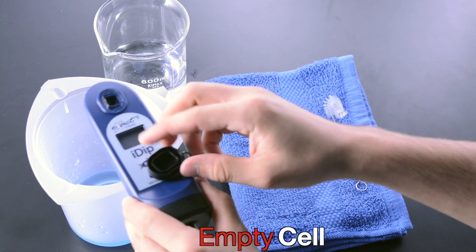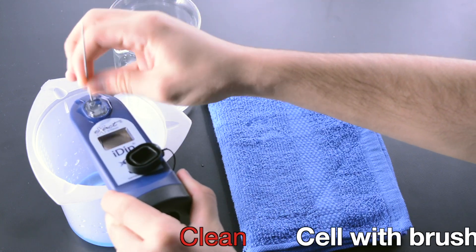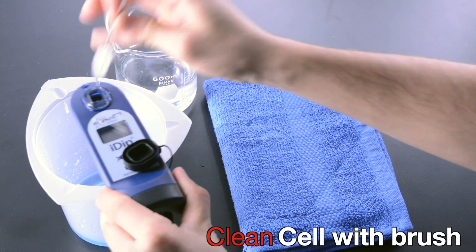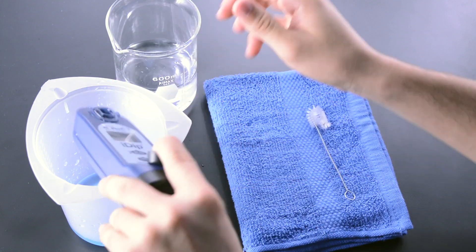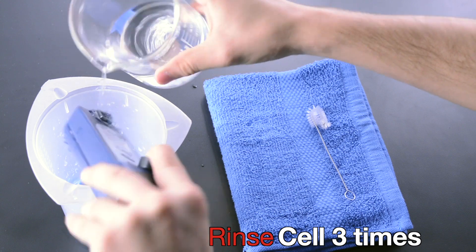Empty Cell. Clean cell with brush. Rinse cell three times.